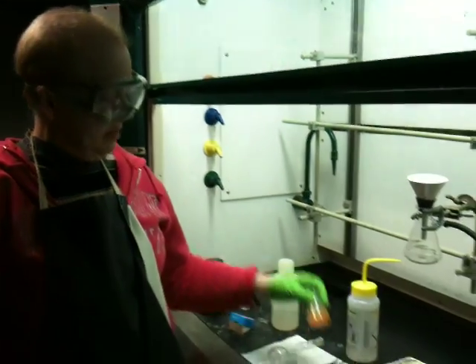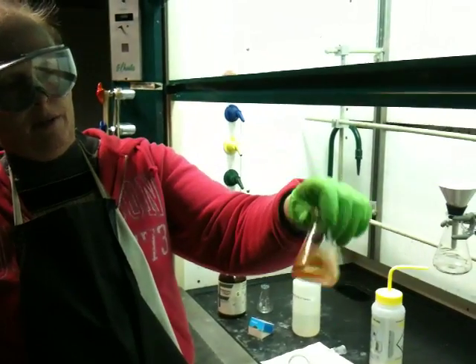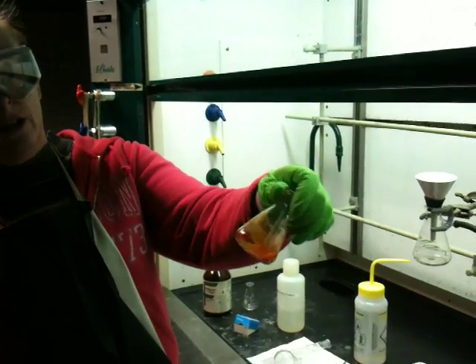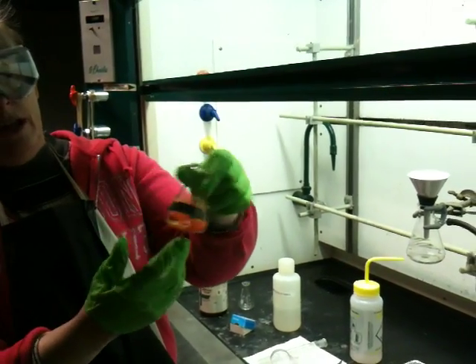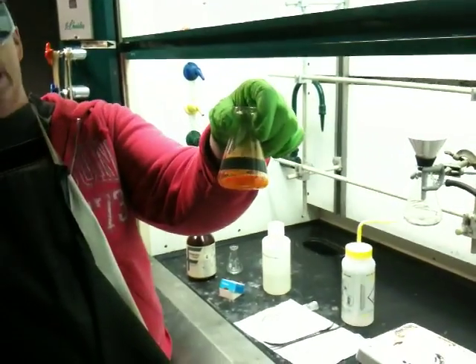I just did the reaction and what you see here is the sample in an Erlenmeyer. You can see some solid and a reddish color. The reddish color is excess bromine.